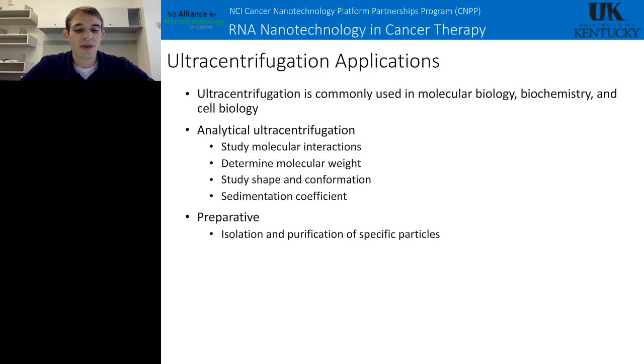So now, just some applications of ultracentrifugation. Ultracentrifugation has very wide applications in many labs, especially those that do molecular biology, biochemistry, and cell biology. Ultracentrifugation can be broken down into 2 different areas: analytical ultracentrifugation and preparative ultracentrifugation.